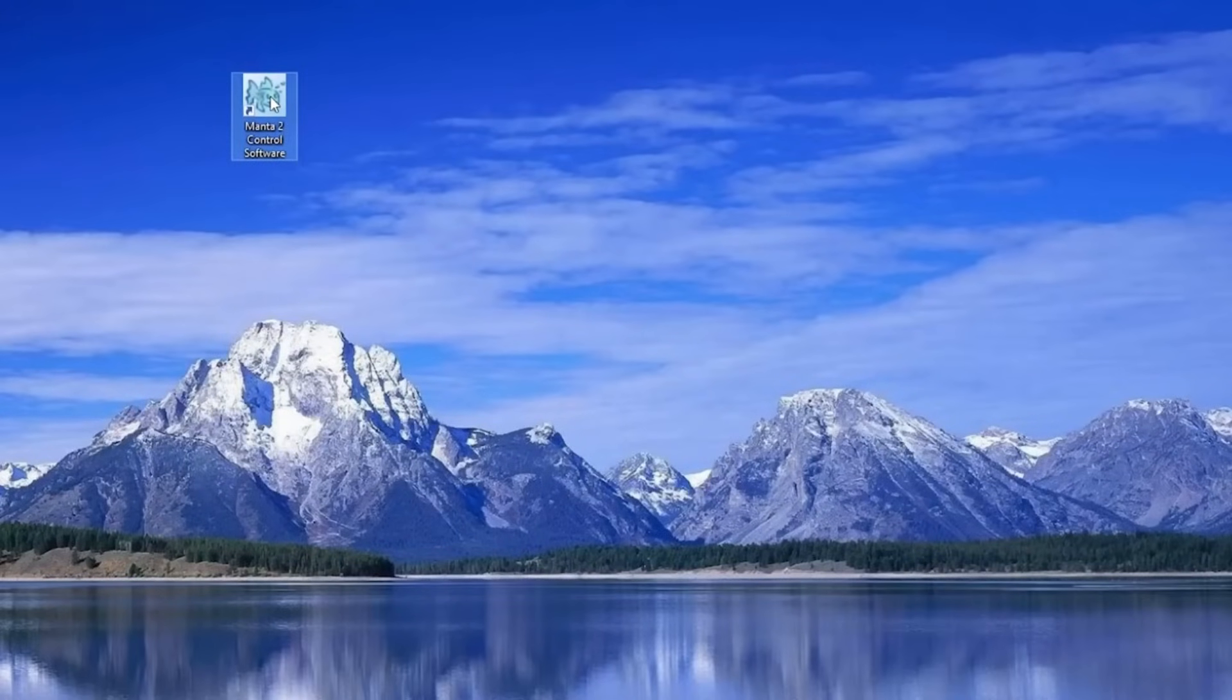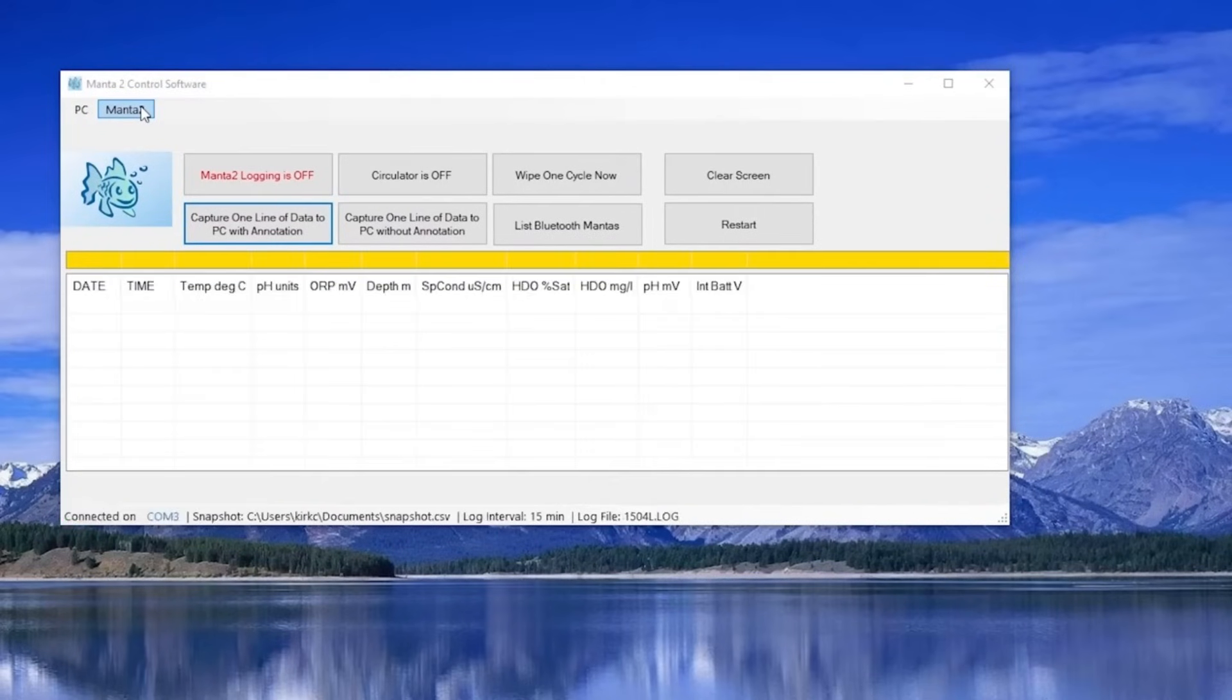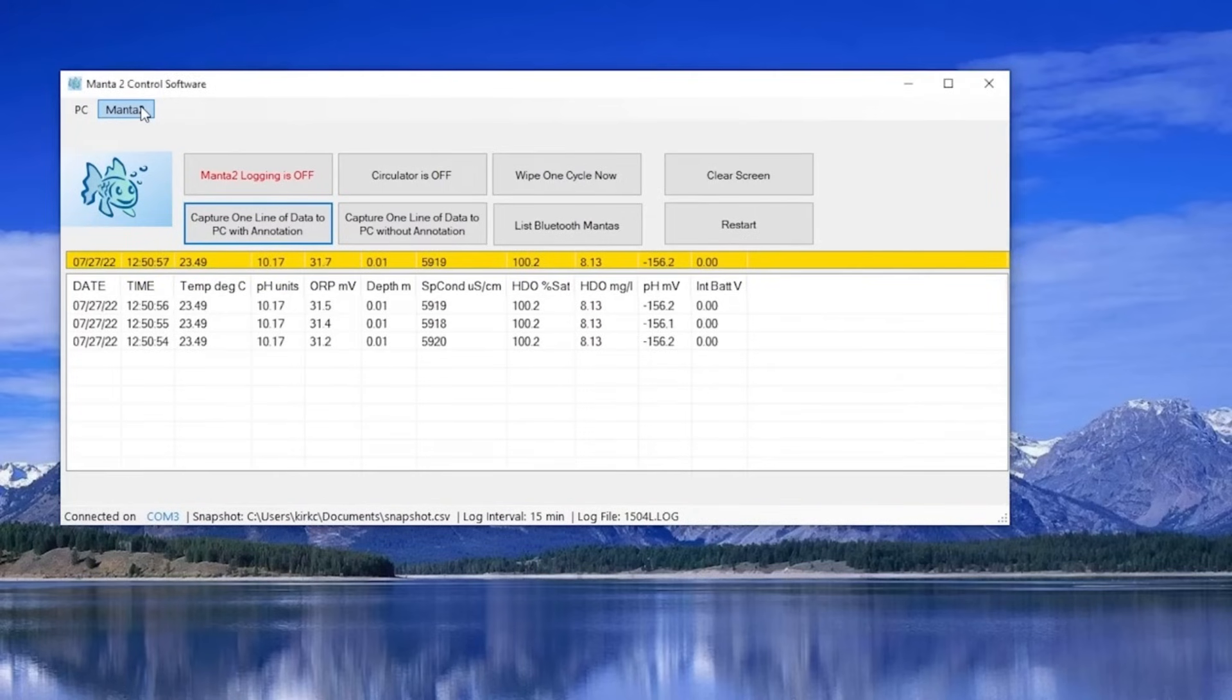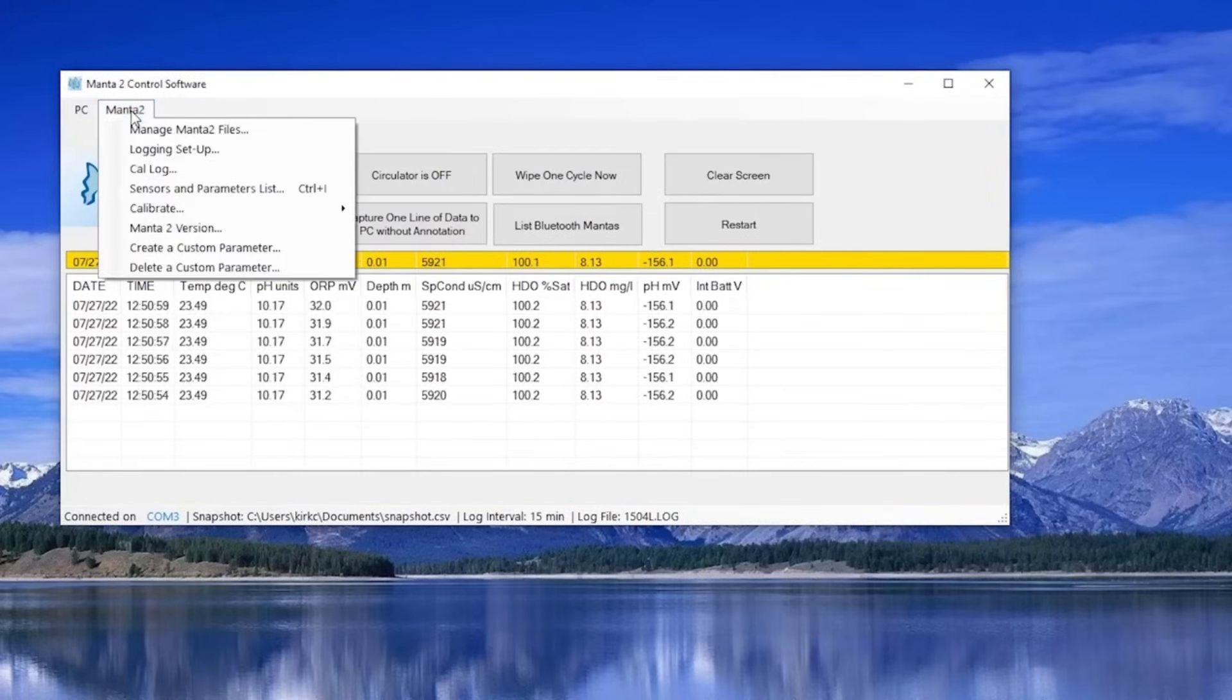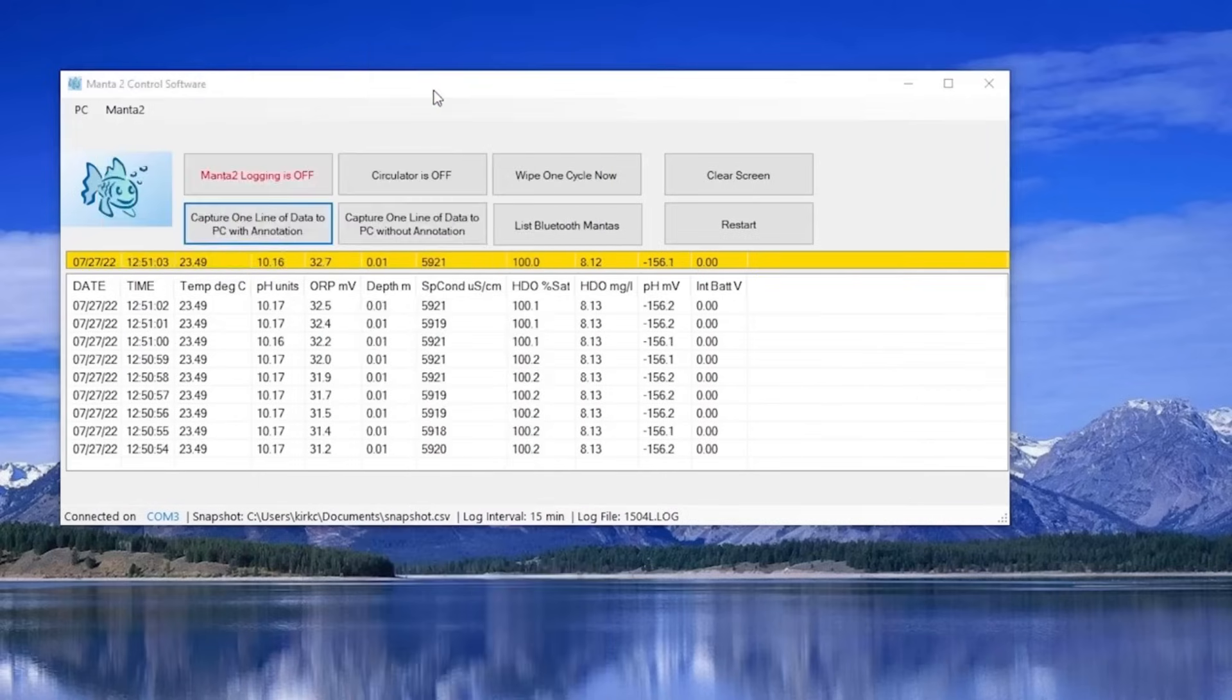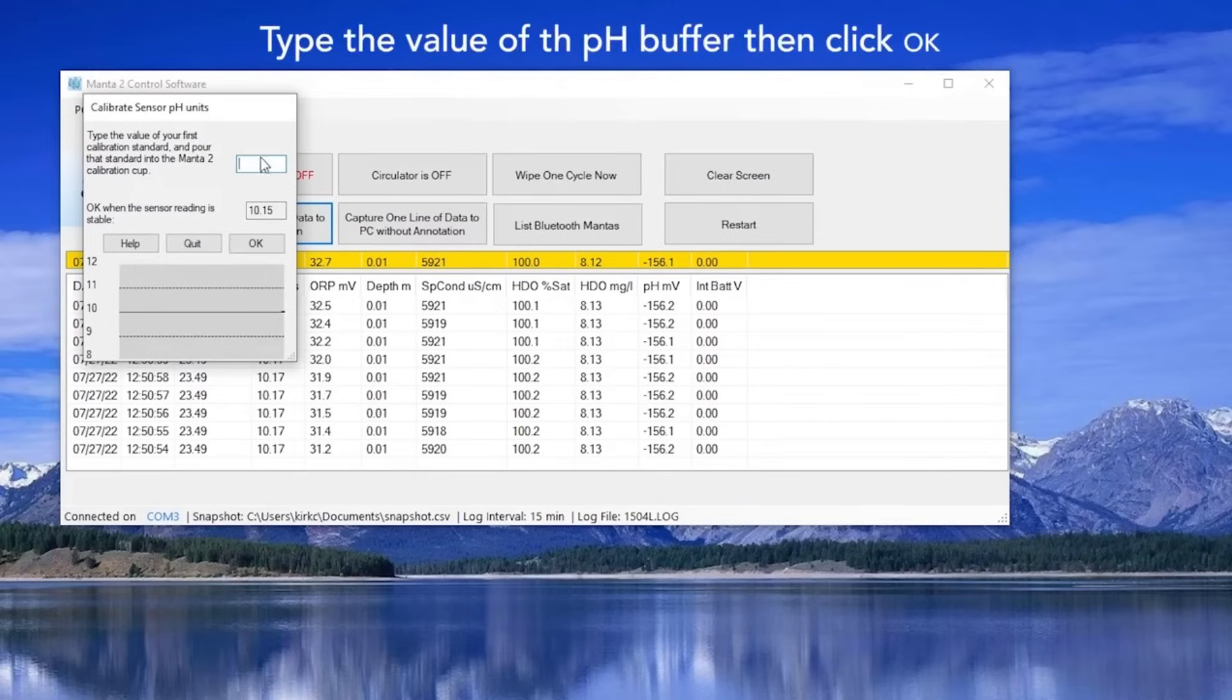Start your program as usual by clicking the icon on your desktop screen. When your pH reading has stabilized, click on the Manta 2 pulldown menu at the top left-hand corner of your screen, hover over calibrate, then click on pH units. You can click OK because you know that your pH buffer's reading has stabilized.